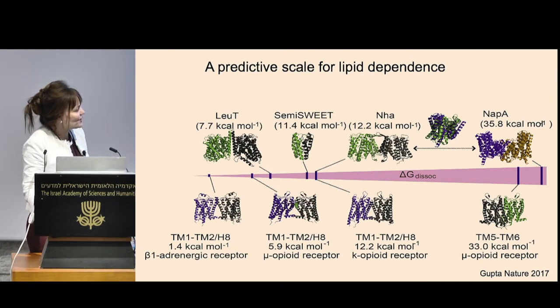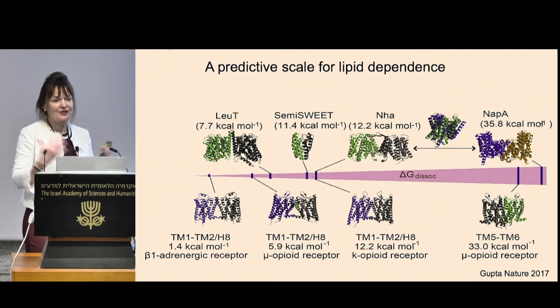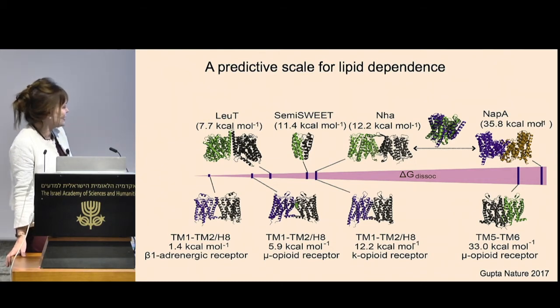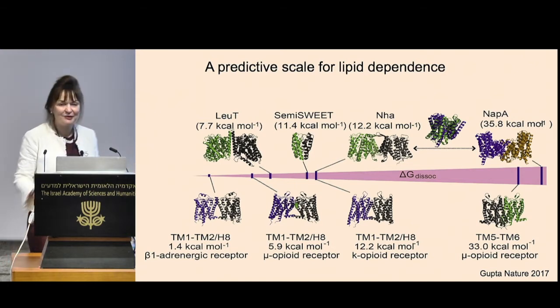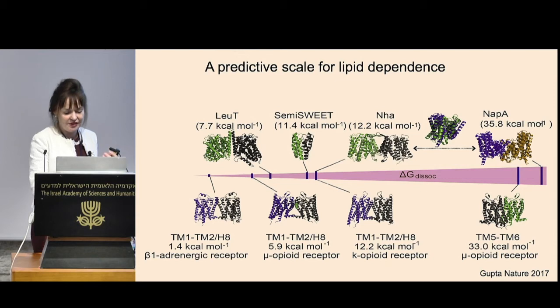This one wasn't thought to be particularly interesting because it was thought to be a crystallographic feature, whereas these were thought that maybe they were coming together transiently, either for action or for other reasons. And you can see here they've even started to model a bit of lipid density. So we thought, let's have a look at some of these. Let's see if we can explore the whole lipid-mediated dimerizations in GPCRs. That was our question.